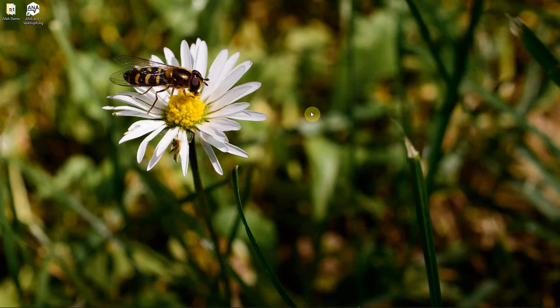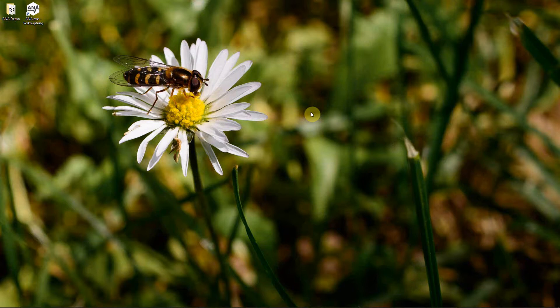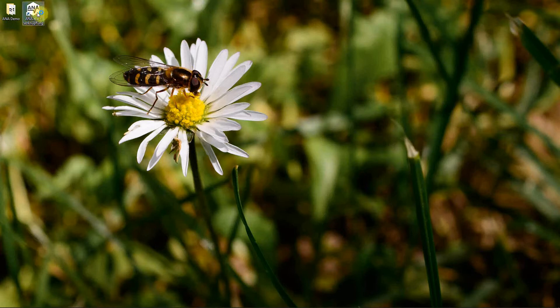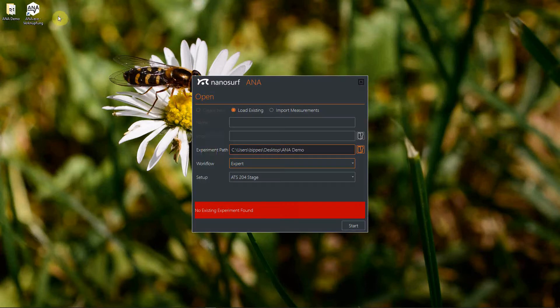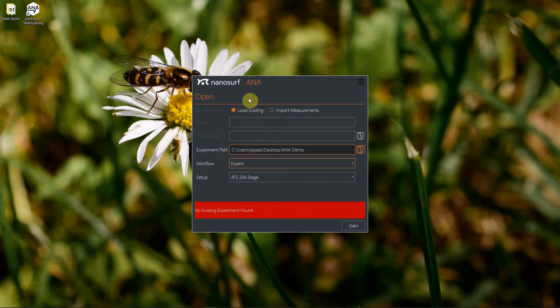Hello, today I want to show you how to use the Anna software to access and post-process data that has been recorded with the Anna software on an automated stage. First of all, we have to start the Anna software. In the splash screen, we have to make sure that we load an existing dataset.